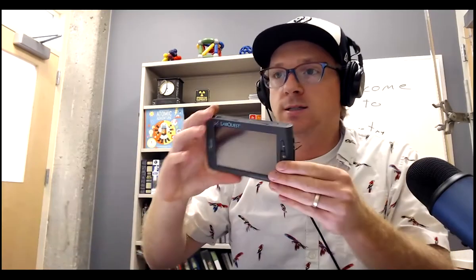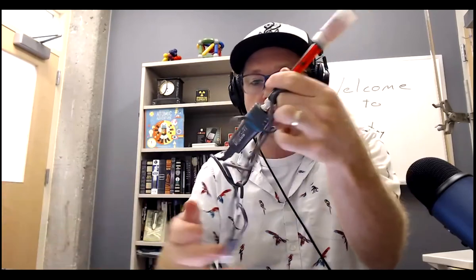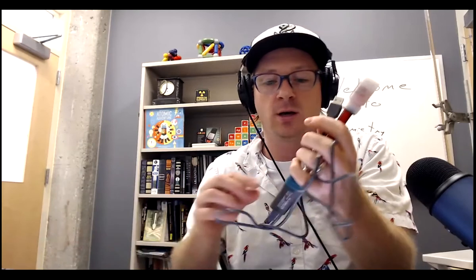Here's the LabQuest. There's a little button on the top, and you can turn that on. And then you will need an ORP sensor. These will probably be in the hoods. You open those up, and there's actually two different ways to connect it. The easiest way is to just plug it in.